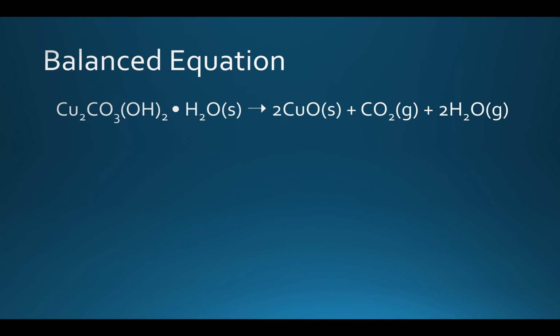Looking back at the mass for our final product, we see that it is lighter than before heating. This is because the H2O and the CO2 unbonded during the reaction. This is consistent with both the definition of decomposition and our balanced reaction.